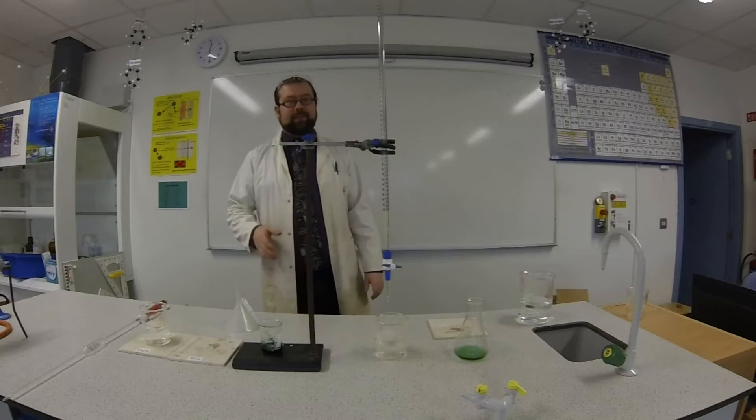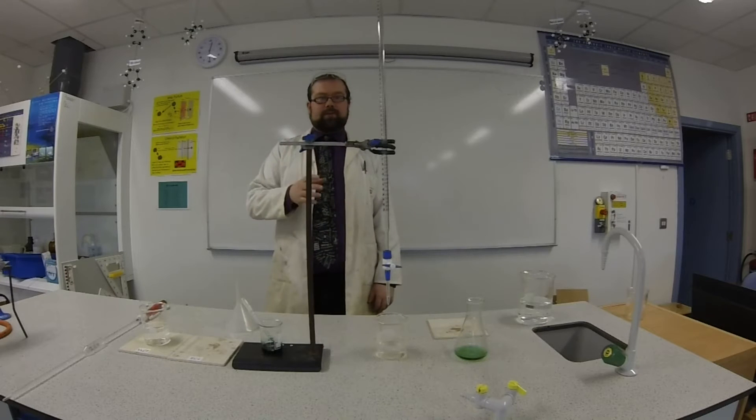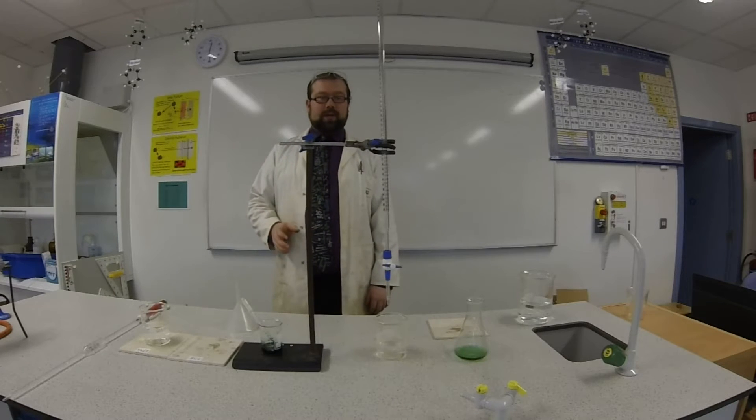Hi, welcome to Science for Schools. Today we are going to be titrating hydrochloric acid against sodium hydroxide and hopefully preparing a sample of salt at the end.